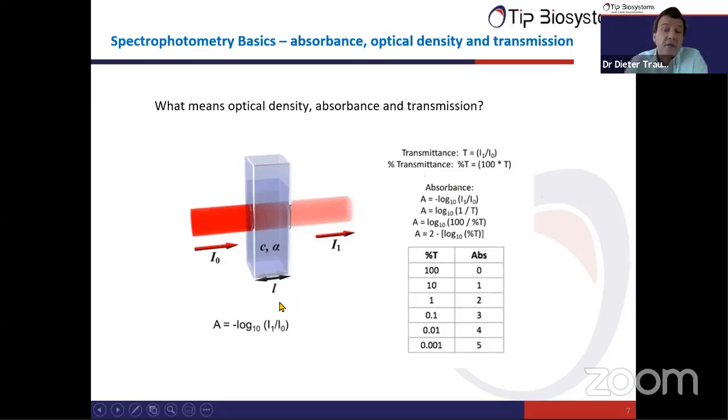And below here, you can also see the formula for A, that's our absorbance. Absorbance and optical density are basically the same. You can use both of these terms. The abbreviation for absorbance is the capital A, and optical density we call capital OD. Now the interesting thing you need to realize in spectrophotometry is that absorbance is actually a logarithmic scale. You see this here in the formula.